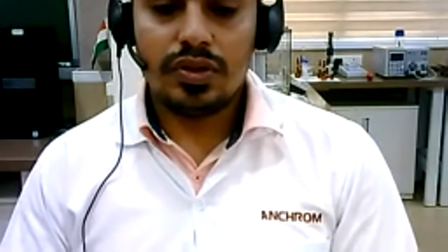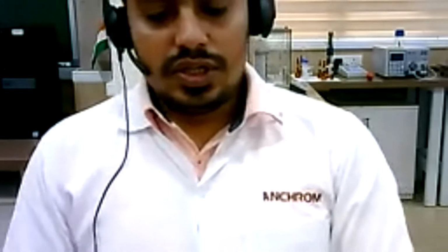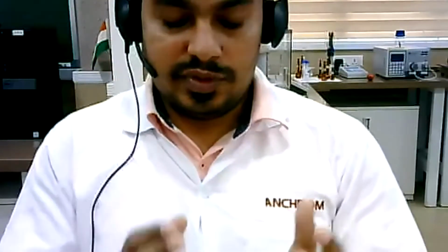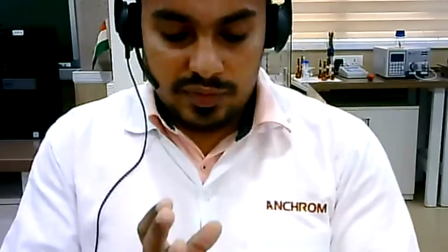Ramakant, there is a question about detection. So how many detector modes are available in HPTLC, and whether hyphenation is required always for detection or HPTLC detectors will work? In HPTLC, you will get the data from the visualizer first.